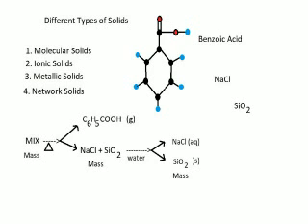And so we can remove the sodium chloride from the sand by just pouring off the solution of salt water we have created. And now we can get the mass of the sand by simply driving the remaining water off the sample by again putting it back onto the hot plate. Having done that, we have the mass of the sample to start with, the mass without the benzoic acid, and then the mass of the sand in the sample. And the sodium chloride, of course, is whatever was left of the sample.